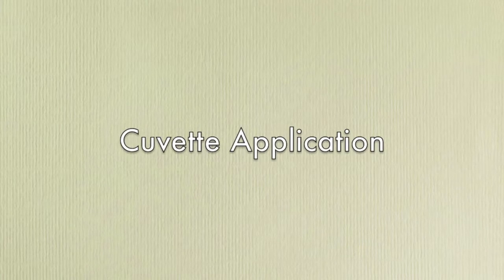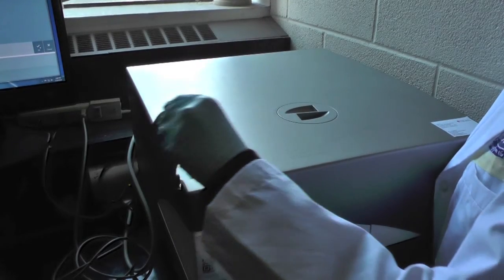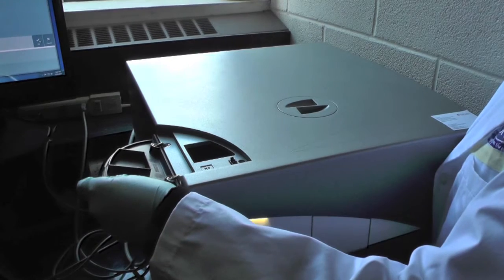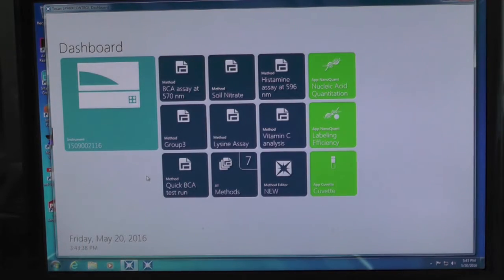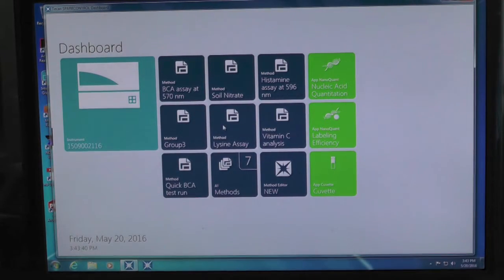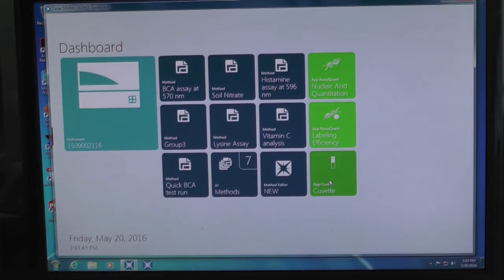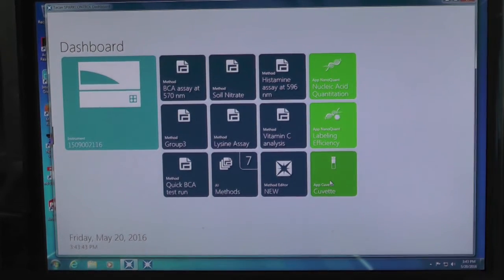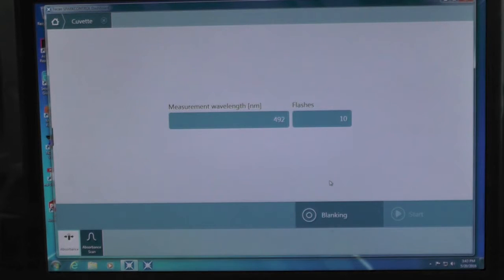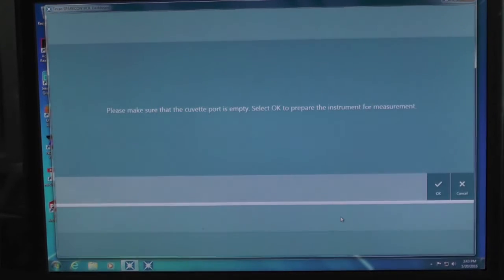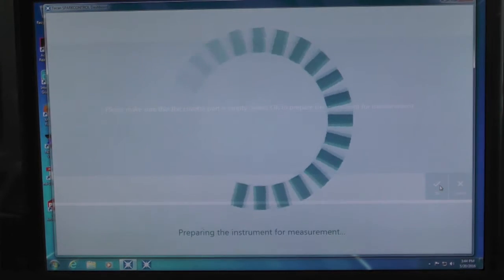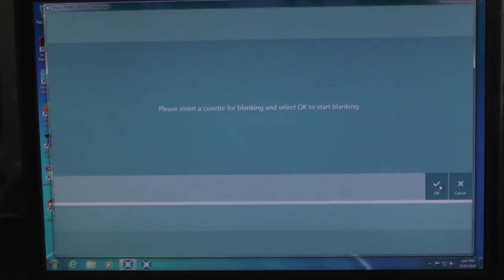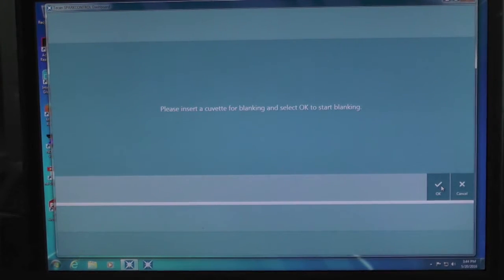Cuvette application. The Tecan Spectrophotometer also has a cuvette port for cuvette reading. On the main dashboard screen, click on the Cuvette app and this will bring you the cuvette application screen. Type in the wavelength of interest, then click blanking. Blanking is first performed without anything in the port to move the light source from the plate reading module to the cuvette reading module.